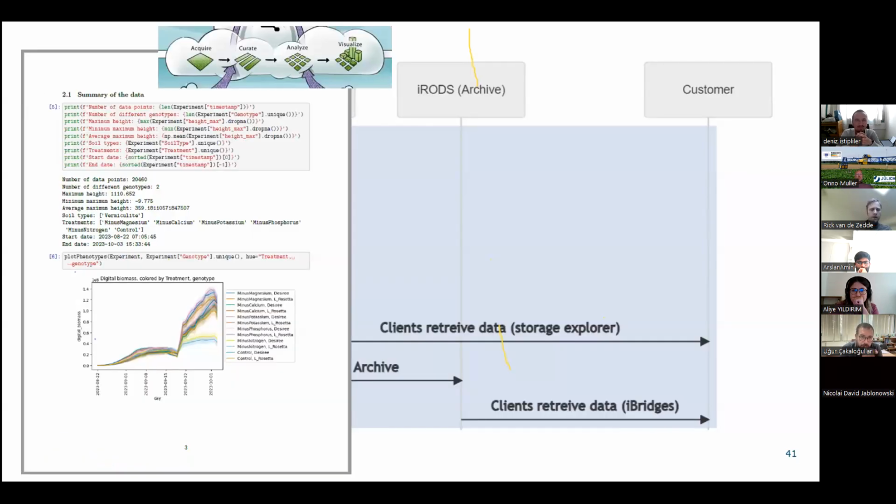On the other hand, this is again a bit of Python. We enable people to use the data and transform the data into these graphs. So this is this digital biomass graph from whatever experiment. That's actually irrelevant. This is a Python notebook that has code on the one hand, but also generates numbers, and users receive this Python notebook to play around with the raw data themselves.